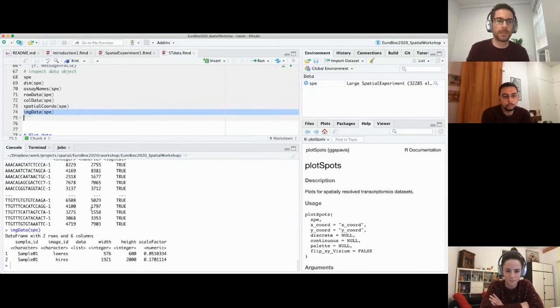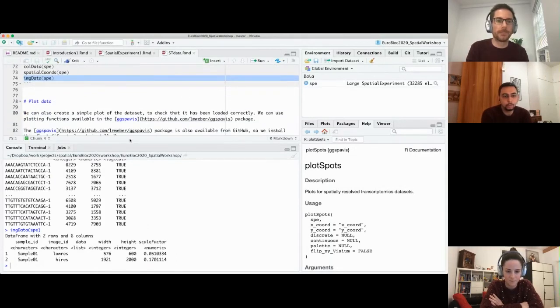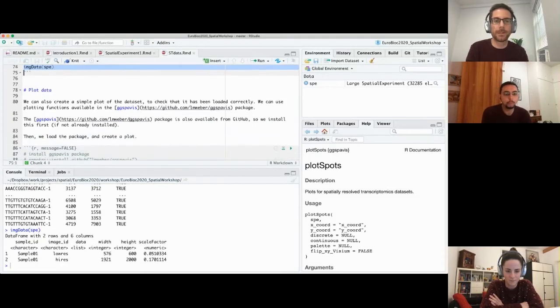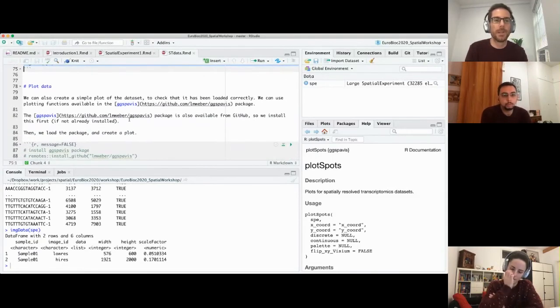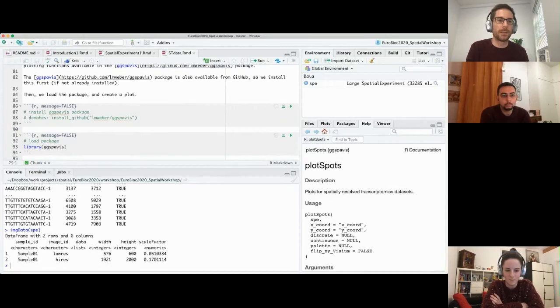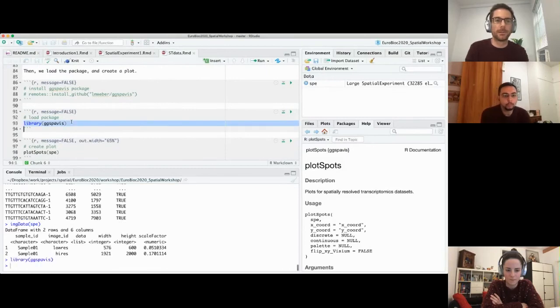And the image data, this is the actual image information, GROB and so on. So now we'll make a simple plot to show what this looks like. We've got this other package called ggSpavis, where we're planning to collect a series of visualization functions. That's also on GitHub for now. Right now we've just got a couple of simple visualization functions in there. Again, if you're working locally, you can install it from my GitHub with that line of code, then load it.